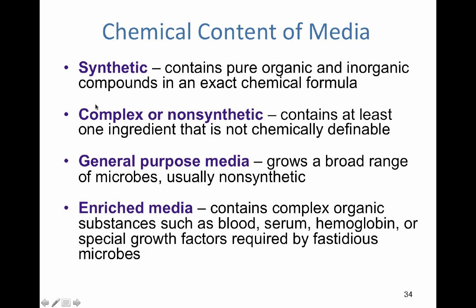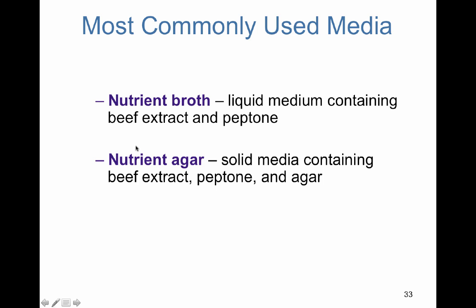Now, remember I said there was a difference between complex and synthetic. Complex media contains at least one ingredient that is not chemically definable. So there's some stuff in there that we don't know exactly the chemical makeup of, whereas with synthetic, we have an exact chemical formula. Generally, what you will be working with is a lot of general purpose nutrient agar. We will be using some of the selective and differential media later in the semester, but I would say the first half of the semester, it's general purpose, and it is nutrient agar.